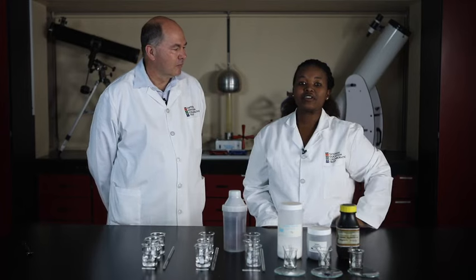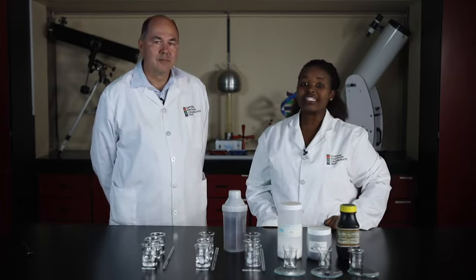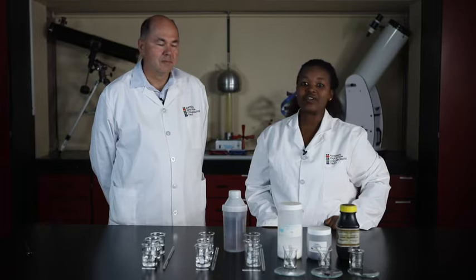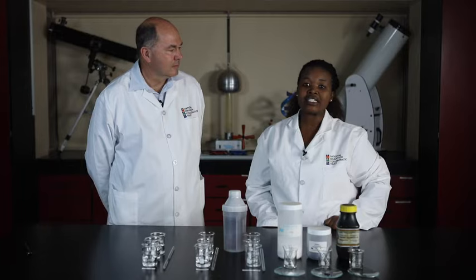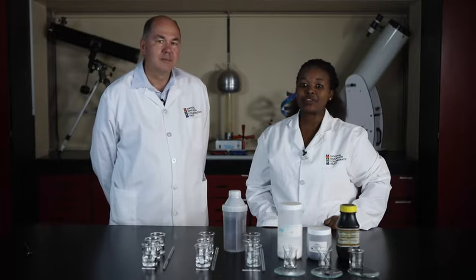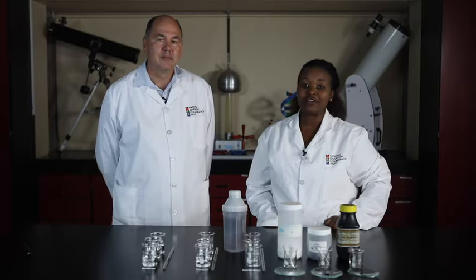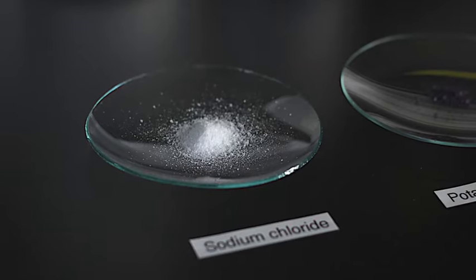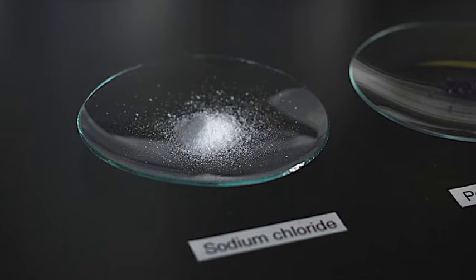If the solute dissolved completely, it will no longer be visible in the beaker. It would have disappeared entirely. We won't see any crystals of sodium chloride in the mixture. If none of the sodium chloride dissolved, we will see it at the bottom of the mixture. It will separate from the solvent and precipitate out of the mixture. If some of the sodium chloride has dissolved, there will be less of it at the bottom of the beaker.